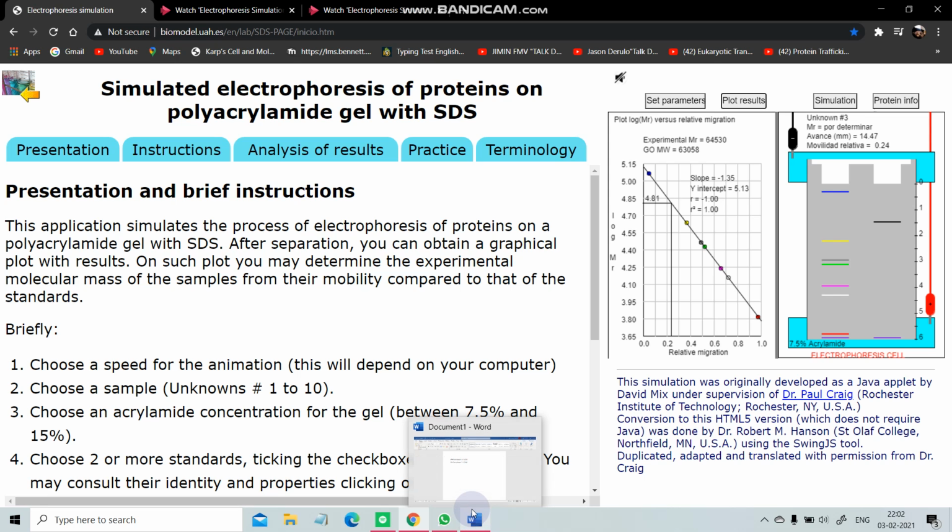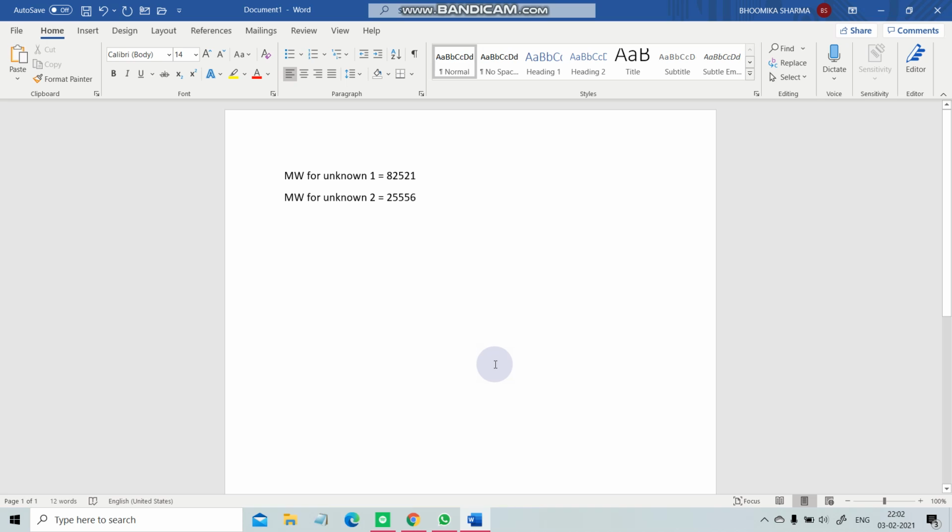So we can write 63058. 63058. All right, here it will come as 63058. Let's just confirm.